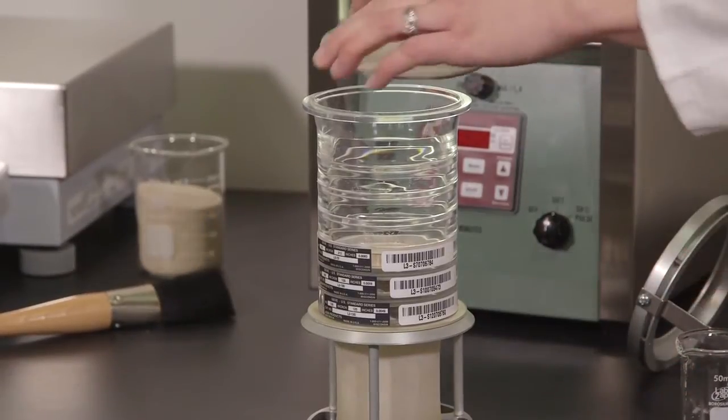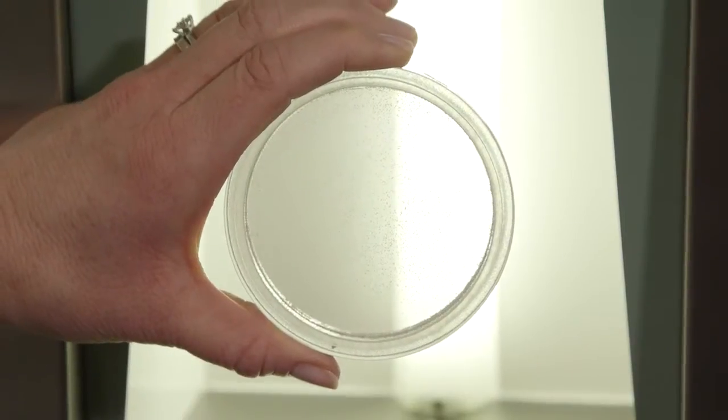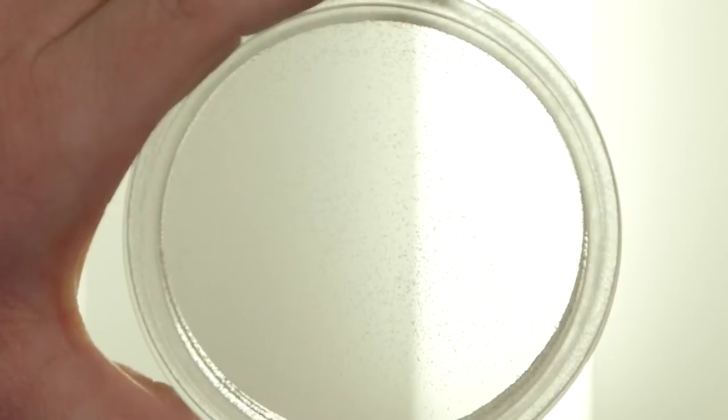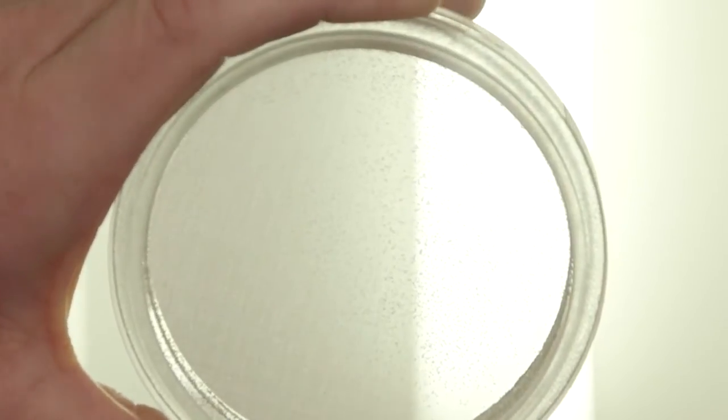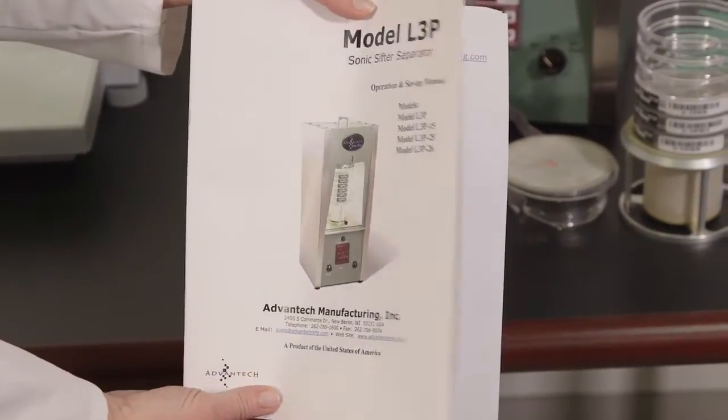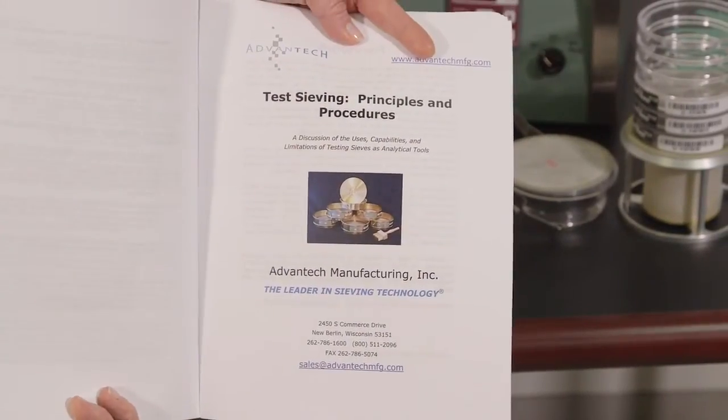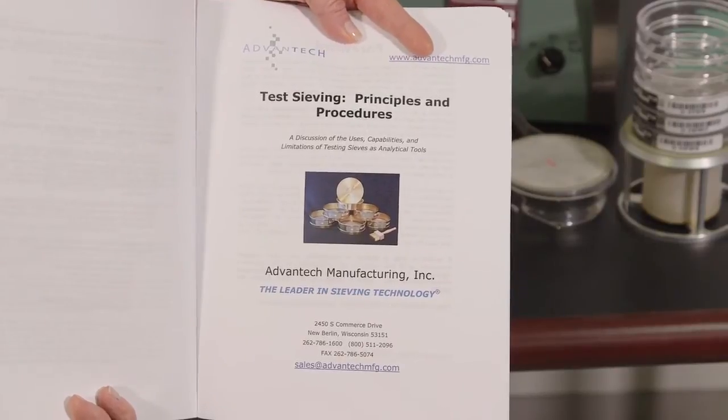Generally speaking, a smaller sample is better. Large samples will overcrowd the sieve and lead to blinding. Large samples may also yield inaccurate results, as not all particles will have equal opportunity to be passed or retained by the wire cloth openings. Refer to Chapter 6 of Test Sieving Principles and Procedures for tips on determining optimum sample size.